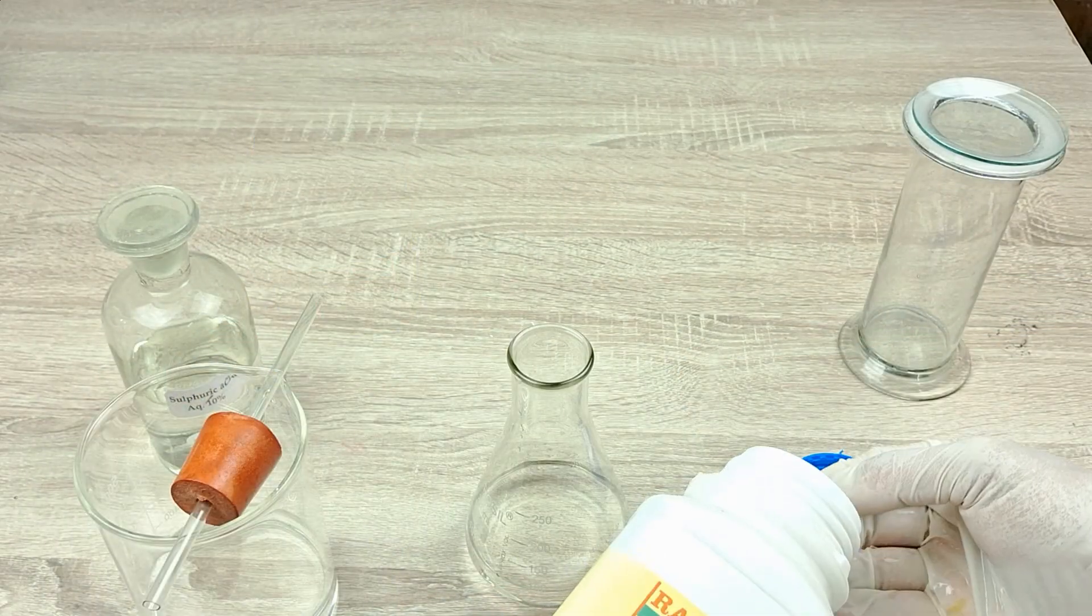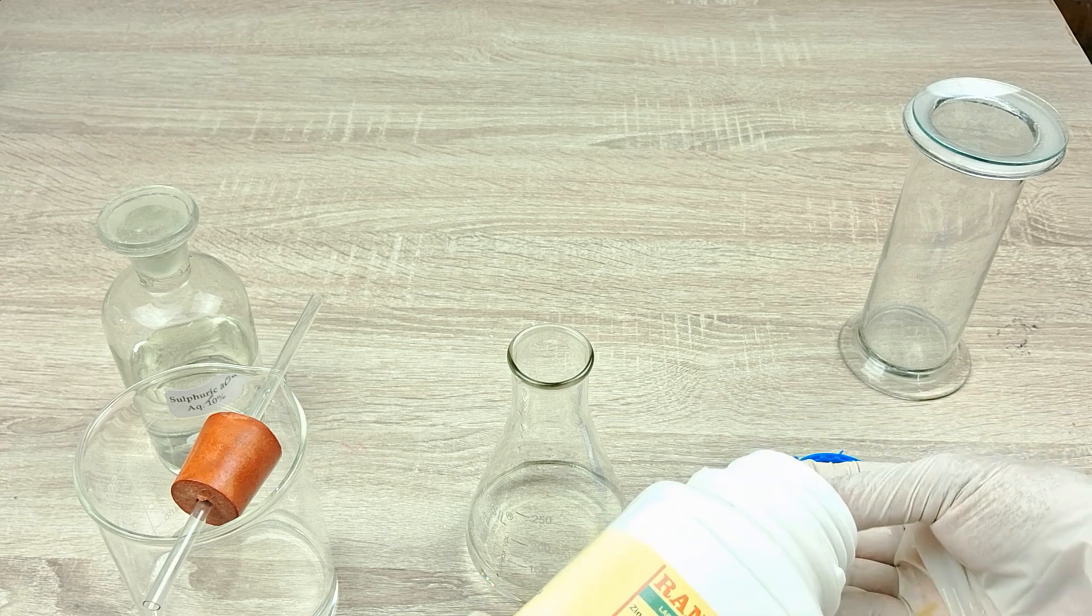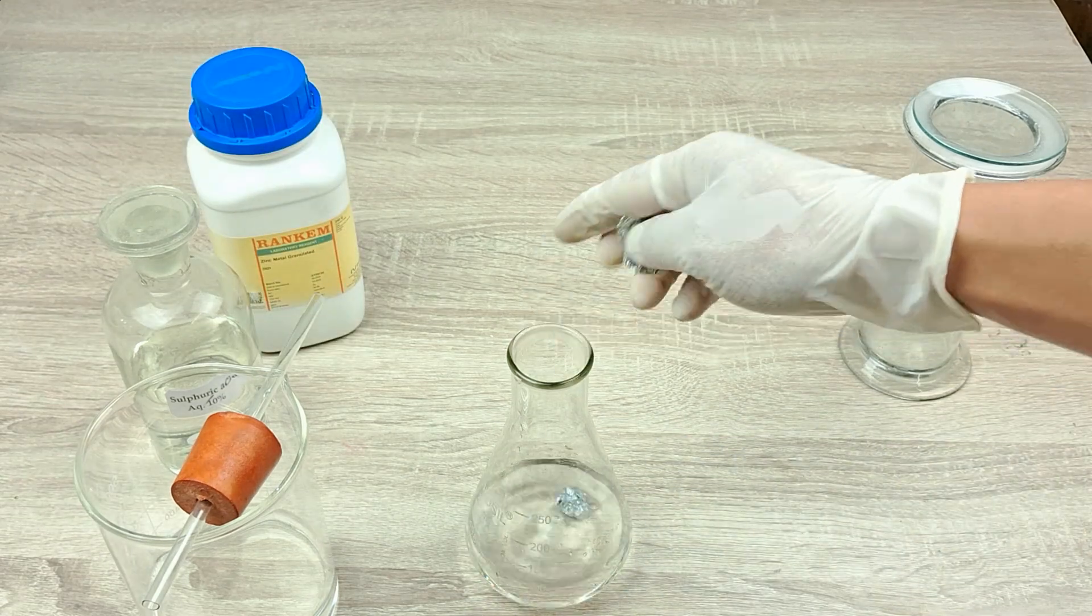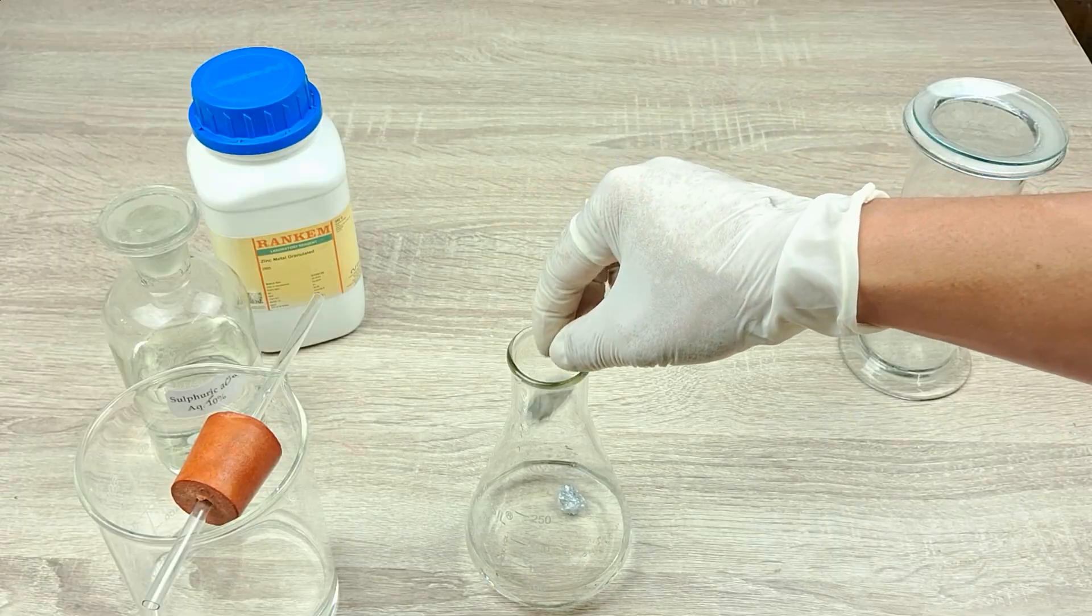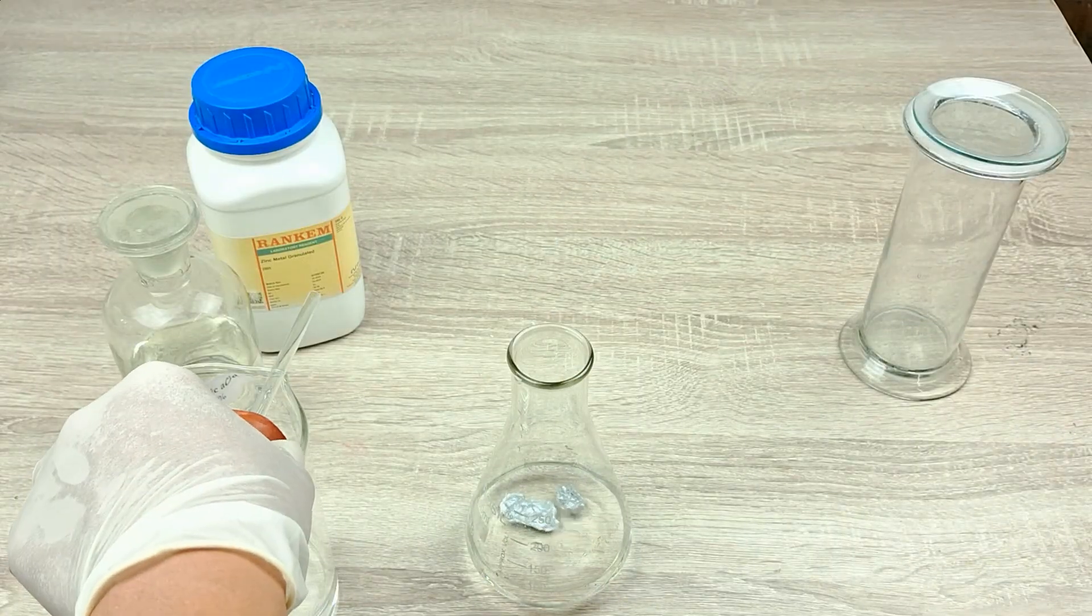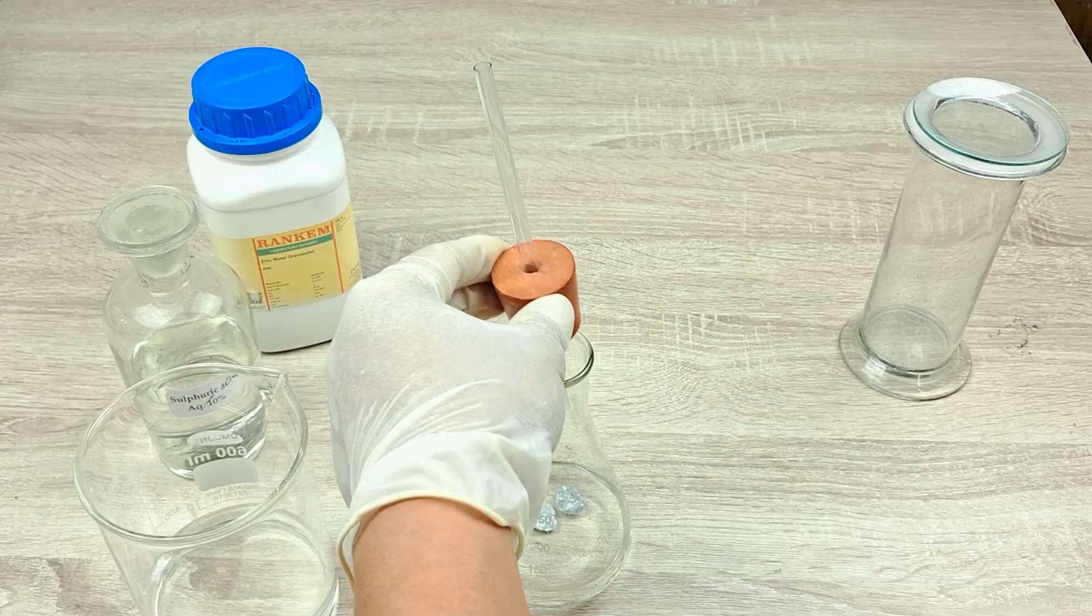Next, introduce a few pieces of zinc granules into the flask containing the acid and quickly cover the mouth tightly with the rubber cork. Allow a minute or so for the reaction to commence in the flask.